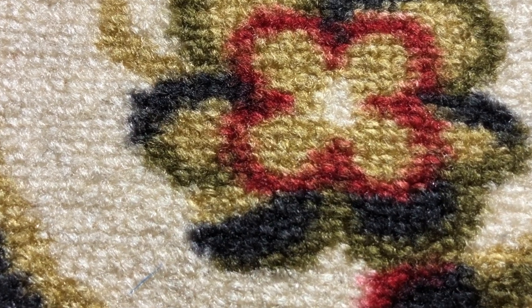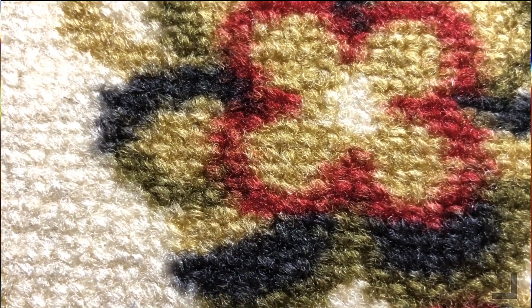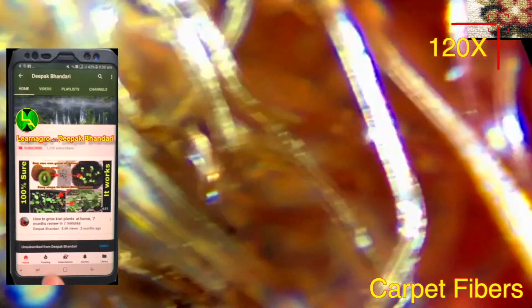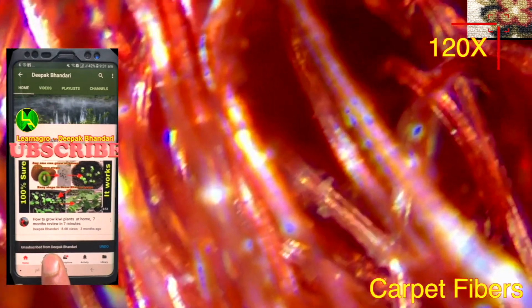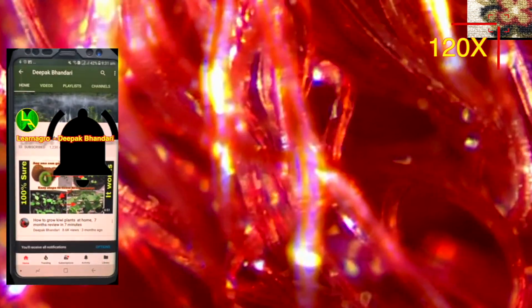We have a carpet, and let's look at it under the microscope at 120 magnification. You can see the fibers — the threads — under the microscope. That looks pretty cool and the color is very interesting.